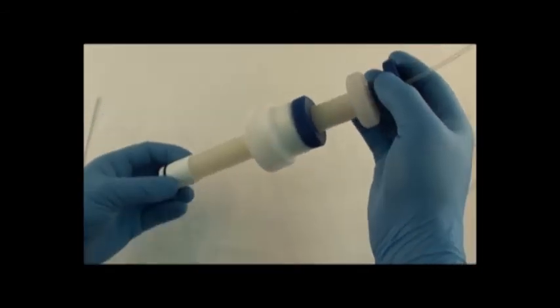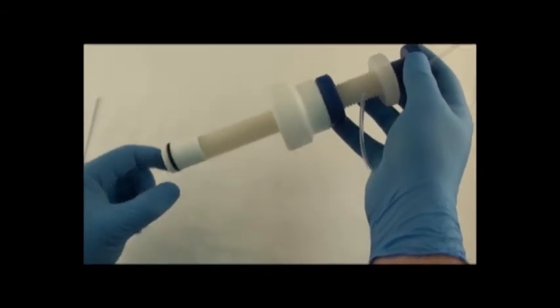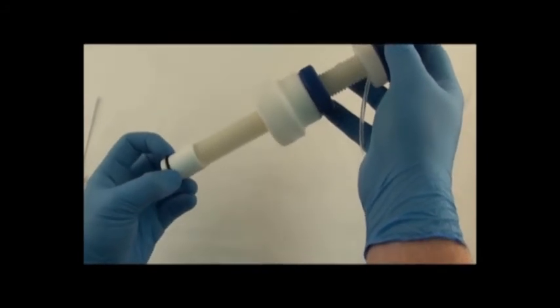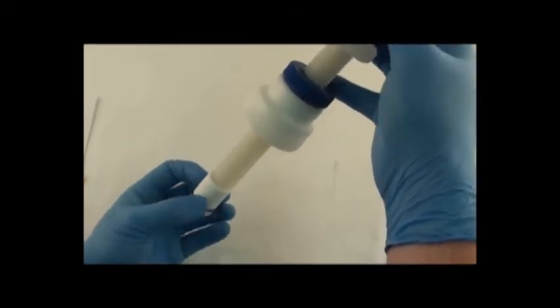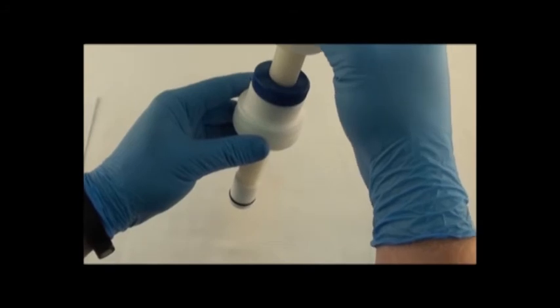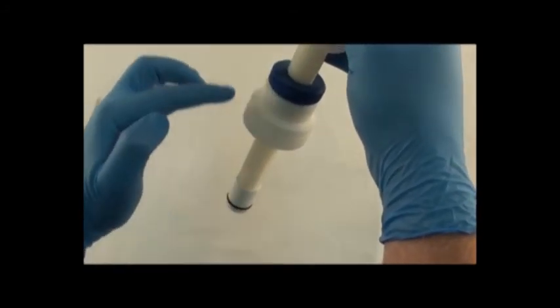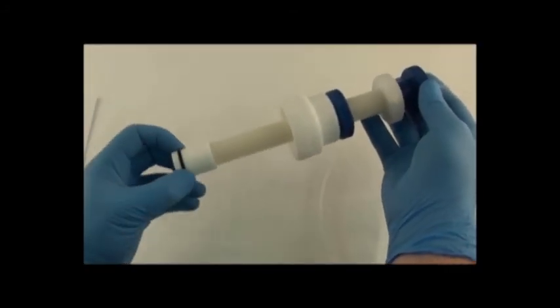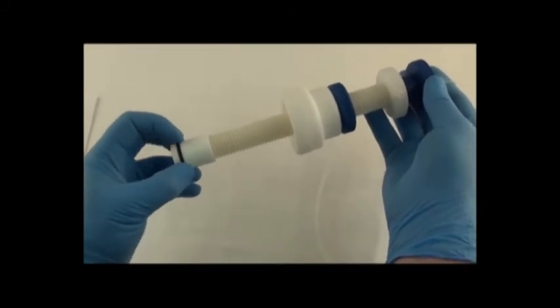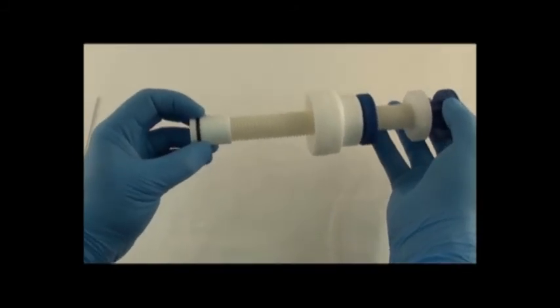And once you've done that and you want to secure the o-ring, seal it against the inside of the column, you tighten the top knob. And that compresses this threaded rod. And it compresses this o-ring against the inside of the chromaflex column and seals it.